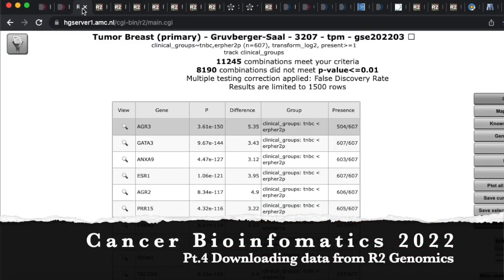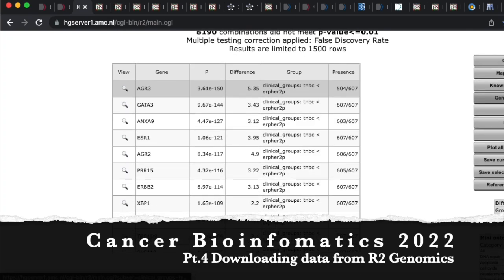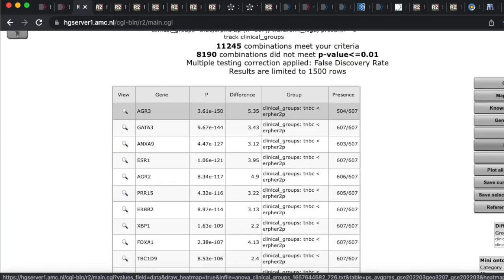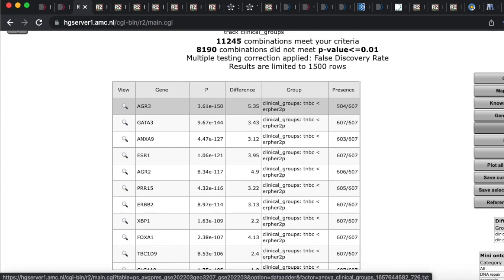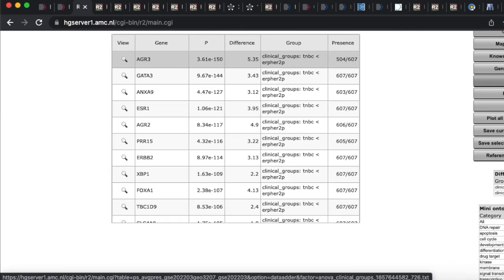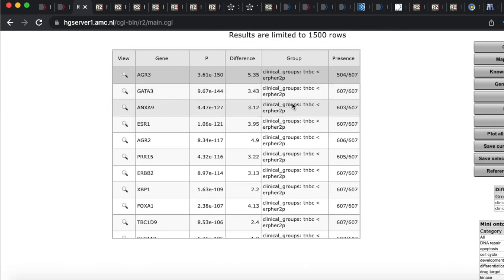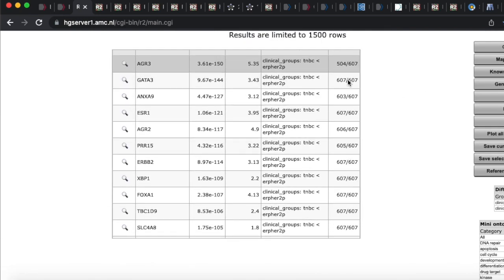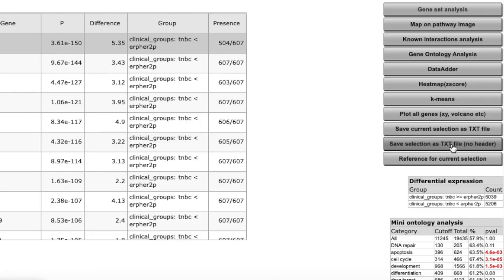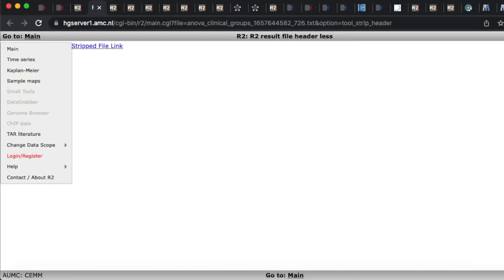So we'll go back to our original one. We did a gene set analysis. Here's what we're gonna do: I can just basically take all of this data. What I'm gonna do is go down to save selection as text file, no header, click on that.